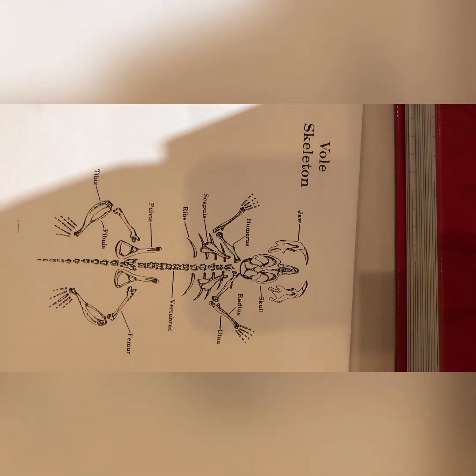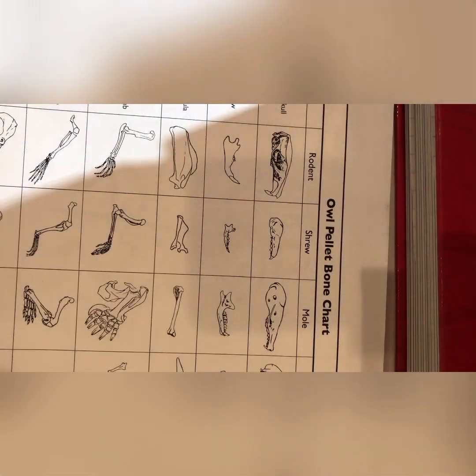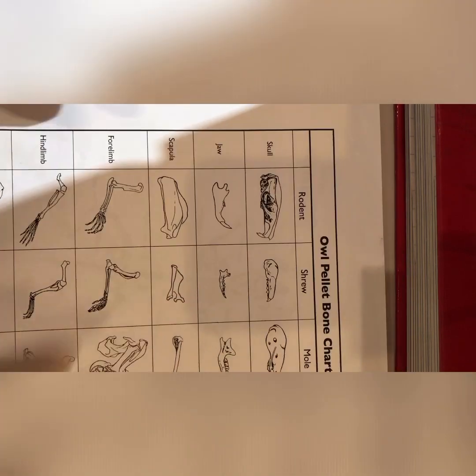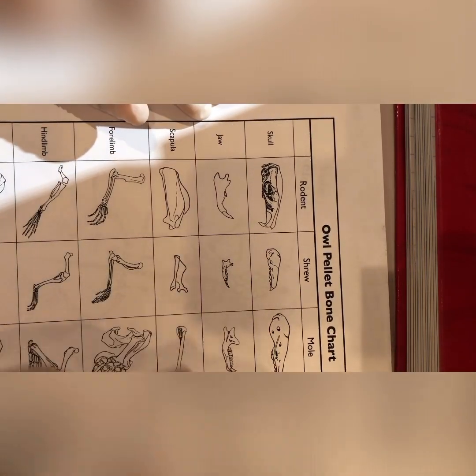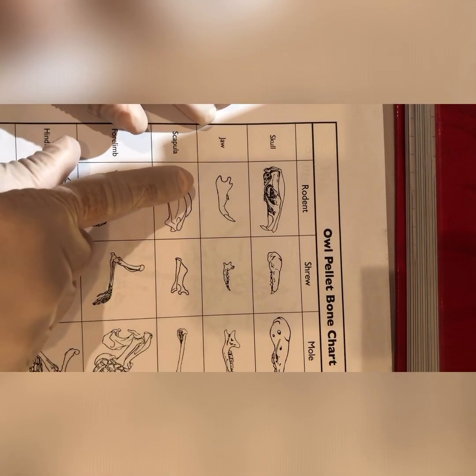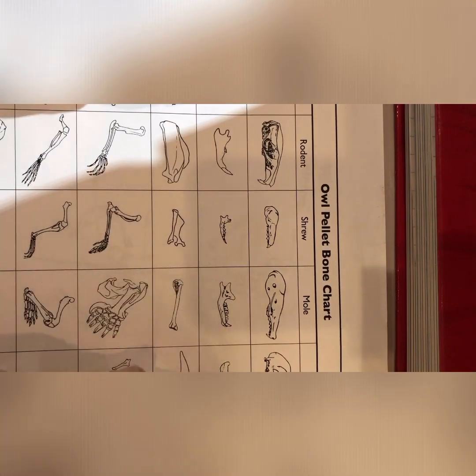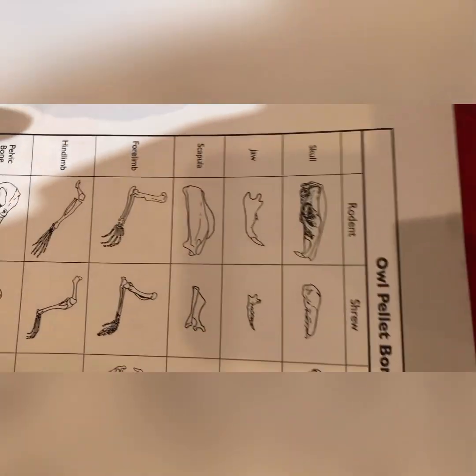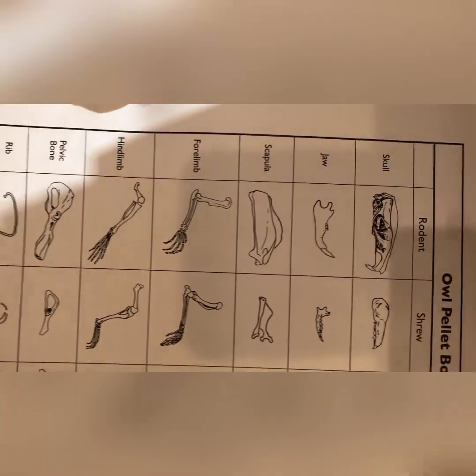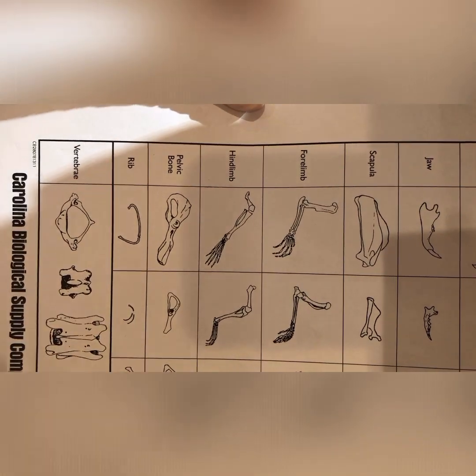And the next thing I'm going to show you is how we know what we have. Here is an owl pellet bone chart. We could look at the skulls. Based on the skulls, I have the rodent, the shrew, the mole, or the bird, the jaw of a rodent, a shrew, a mole, or a bird, and all the different body parts, right? There's the scapula, the forelimbs, the hind limbs, the pelvic bone, the rib, and finally the vertebrae.